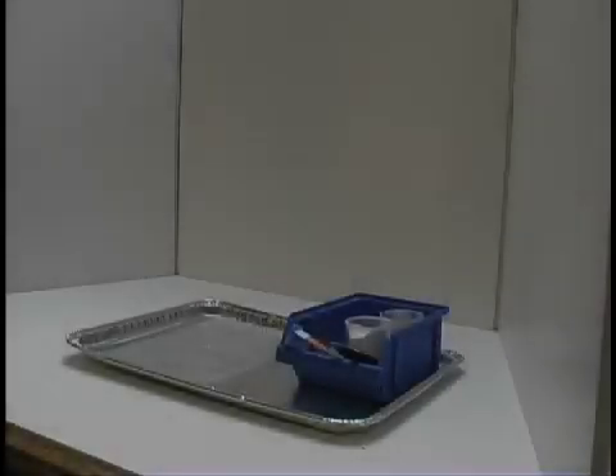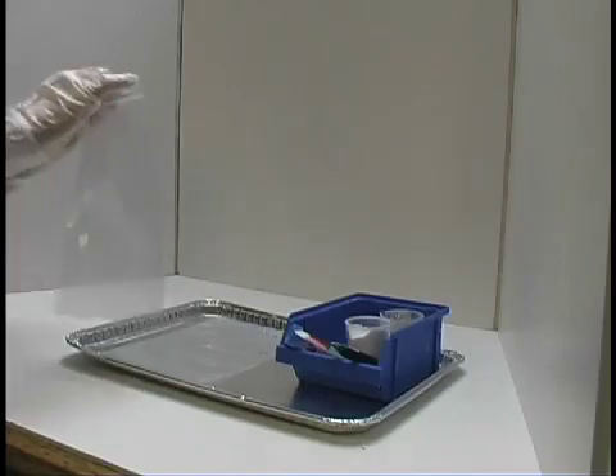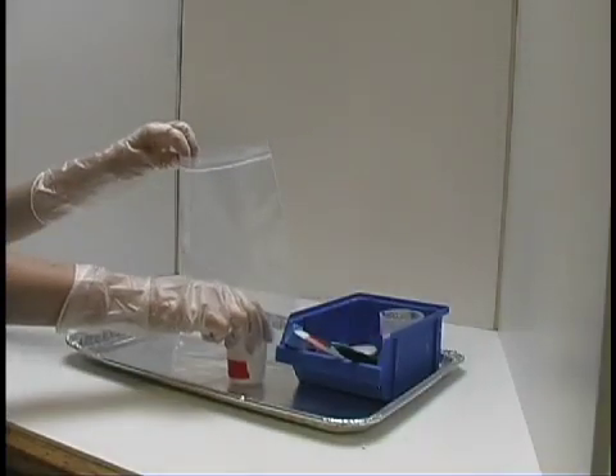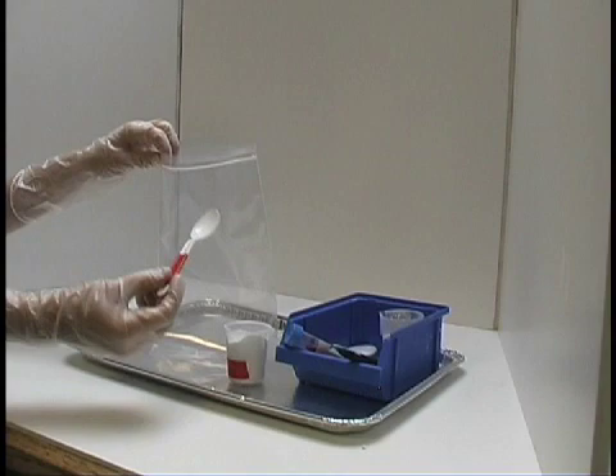First, assemble all your materials. Baking soda, calcium chloride, phenol red, and water are your reactants. You will also need spoons, plastic bags, a tray, and gloves and goggles for each person. And don't forget your worksheet.